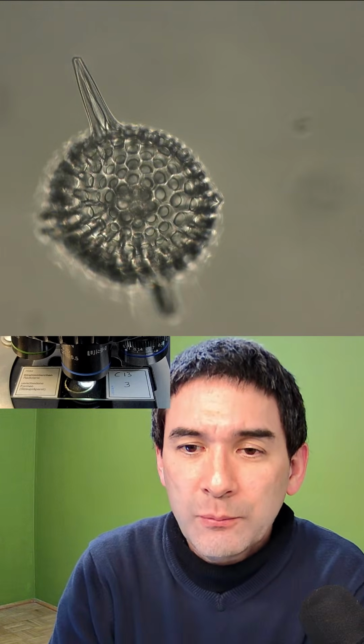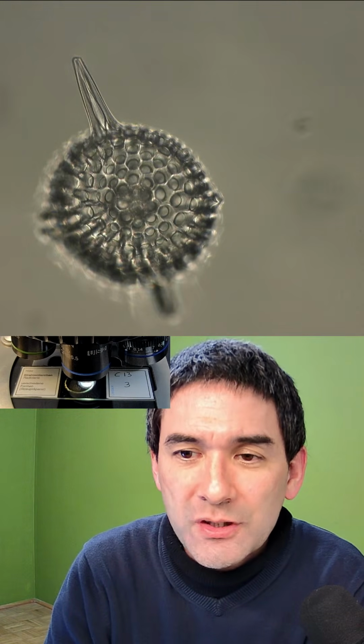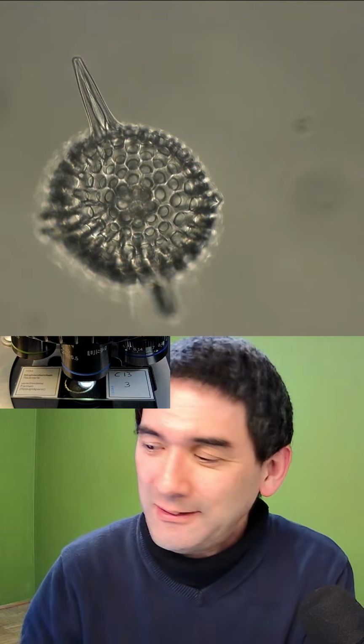Okay, so I'm just reading. Would you please add more biology relating to the slides? Pretty pictures alone are fine, but little value. Okay, fine. Unfortunately, I don't know where they were collected, those radiolarians.